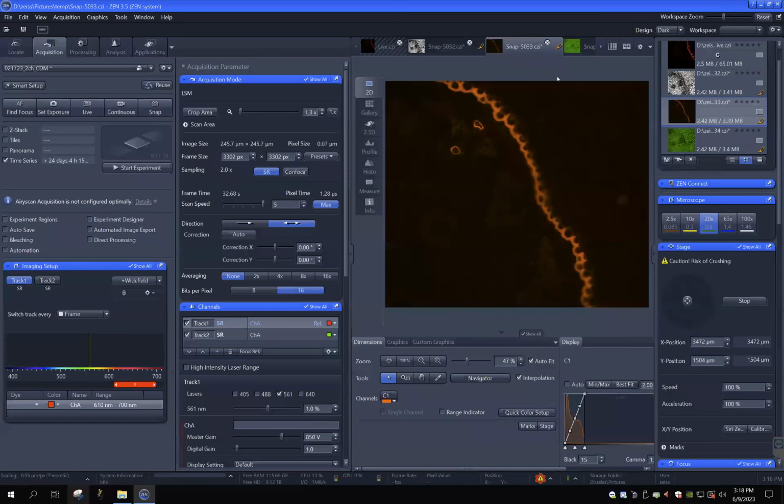Okay, here we are. We are done with the localization of the sample we are trying to look at. Next step, we use this acquisition mode to set up the parameters for area scan, for super resolution, and for all the dyes that we are using. For example, here we use our calibration chip, and I know that they are stained with two different dyes.